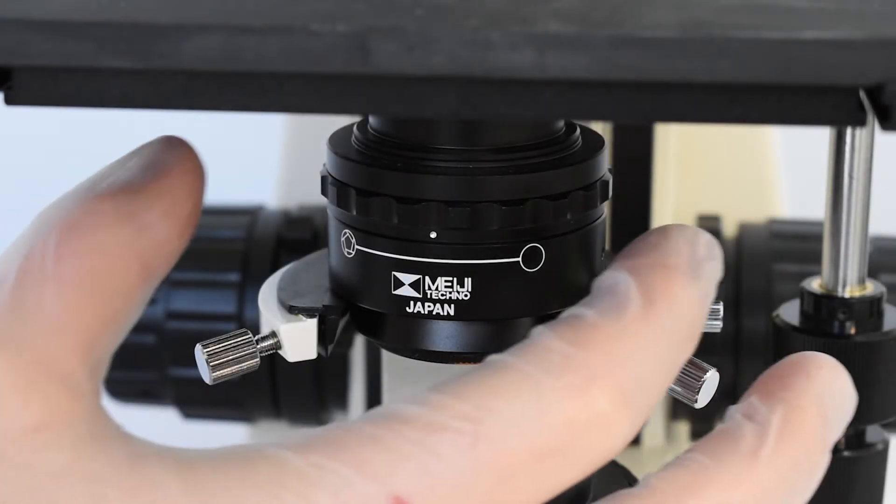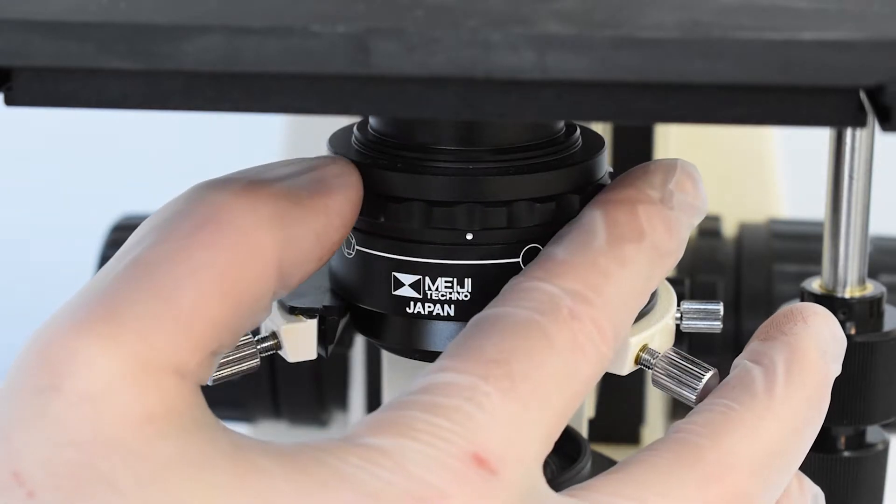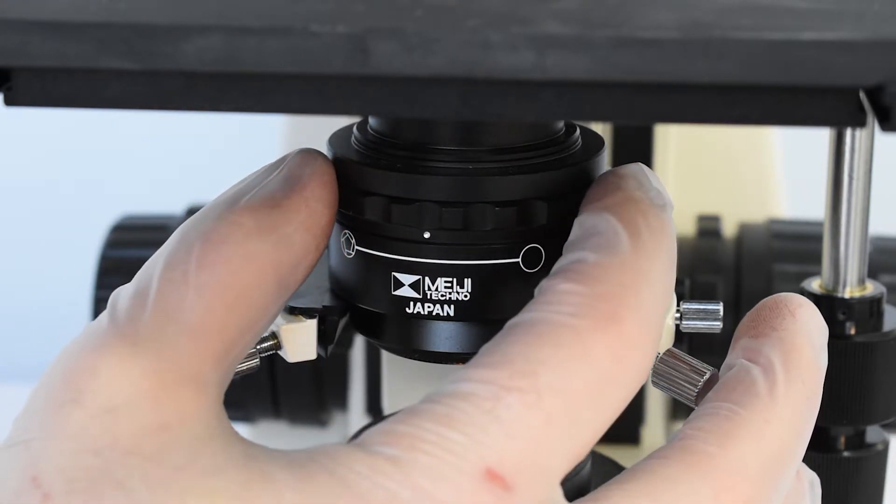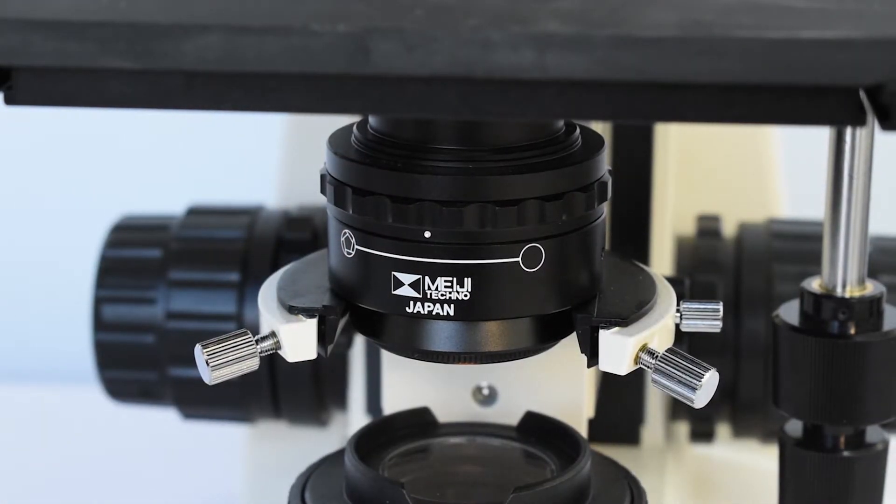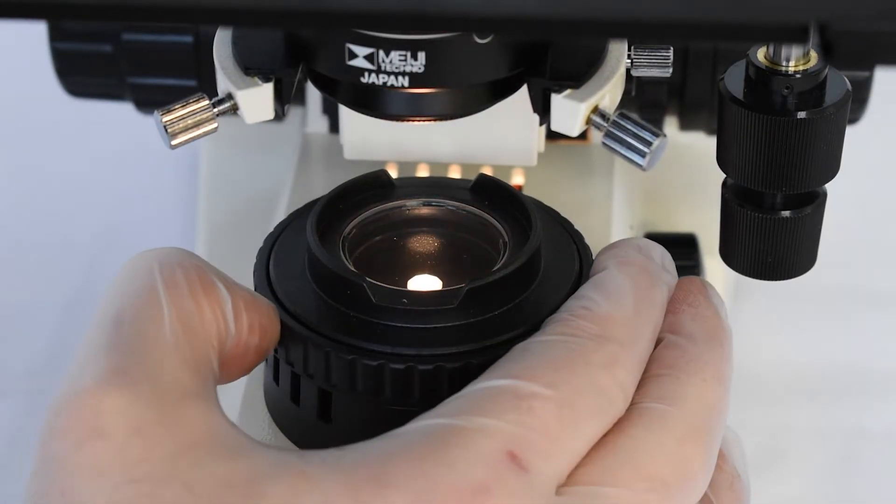To carry out this procedure it is necessary to use the condenser controls, height adjustment, centering screws, and aperture diaphragm. Also, the field diaphragm of the collector lens is important.